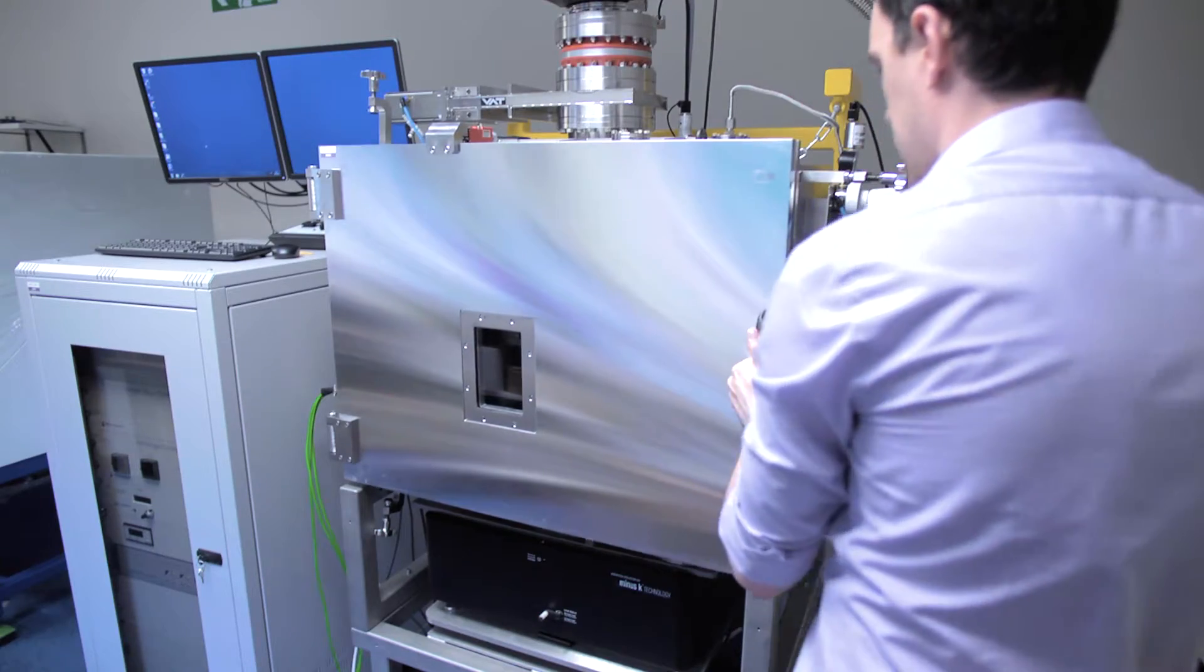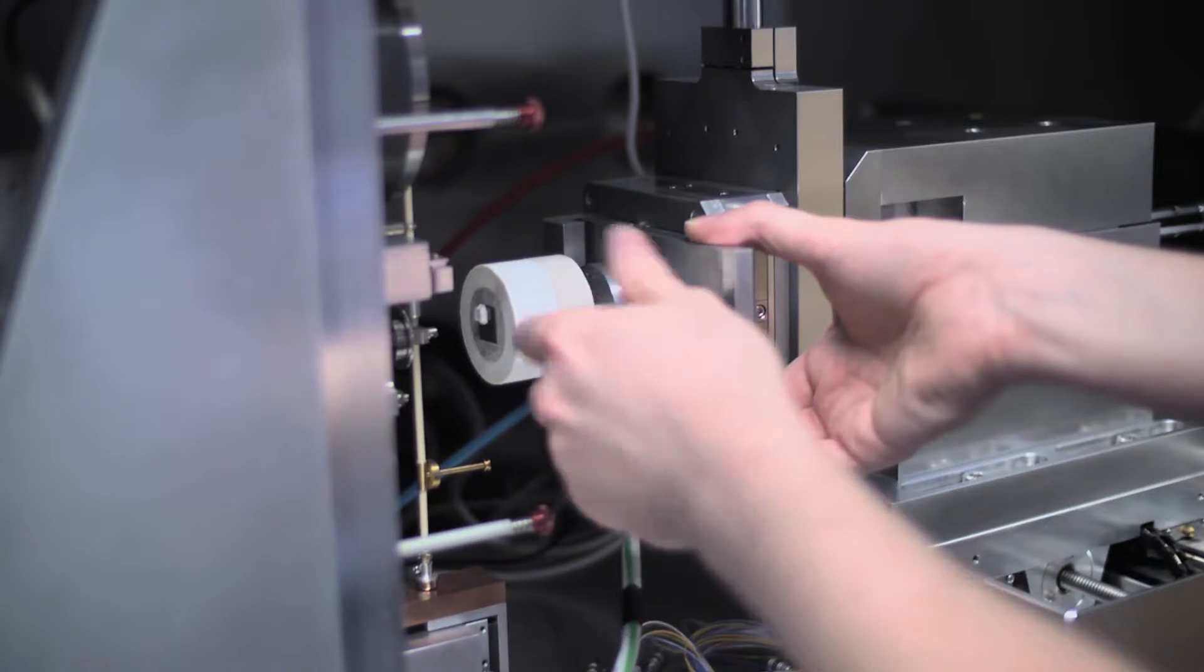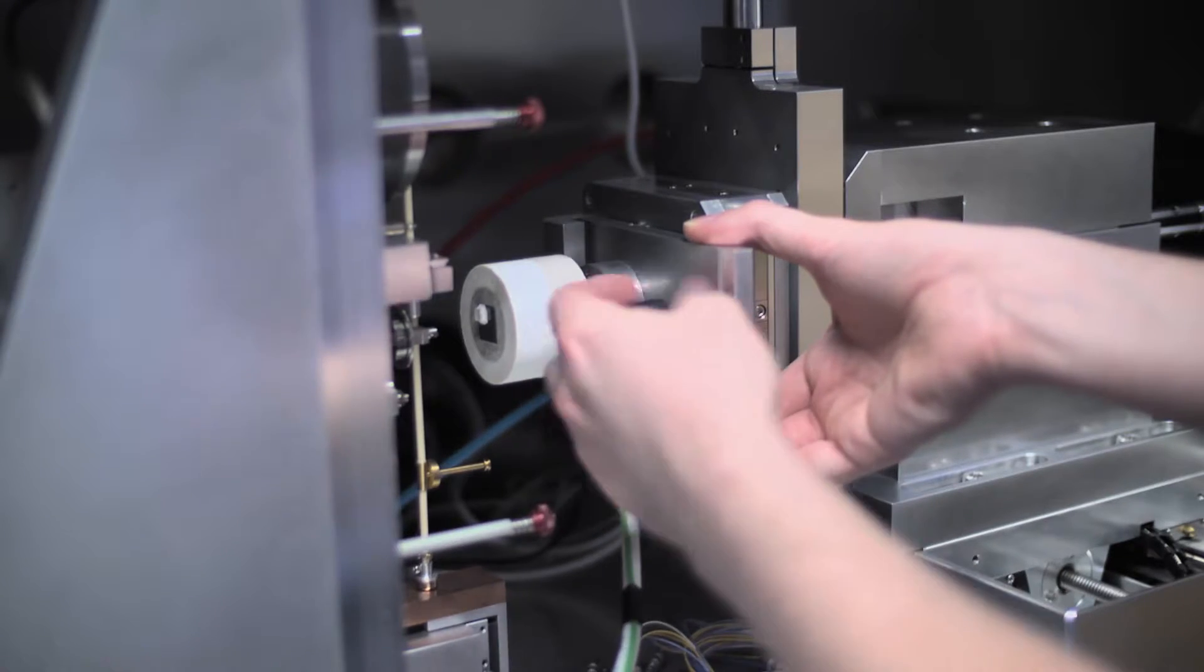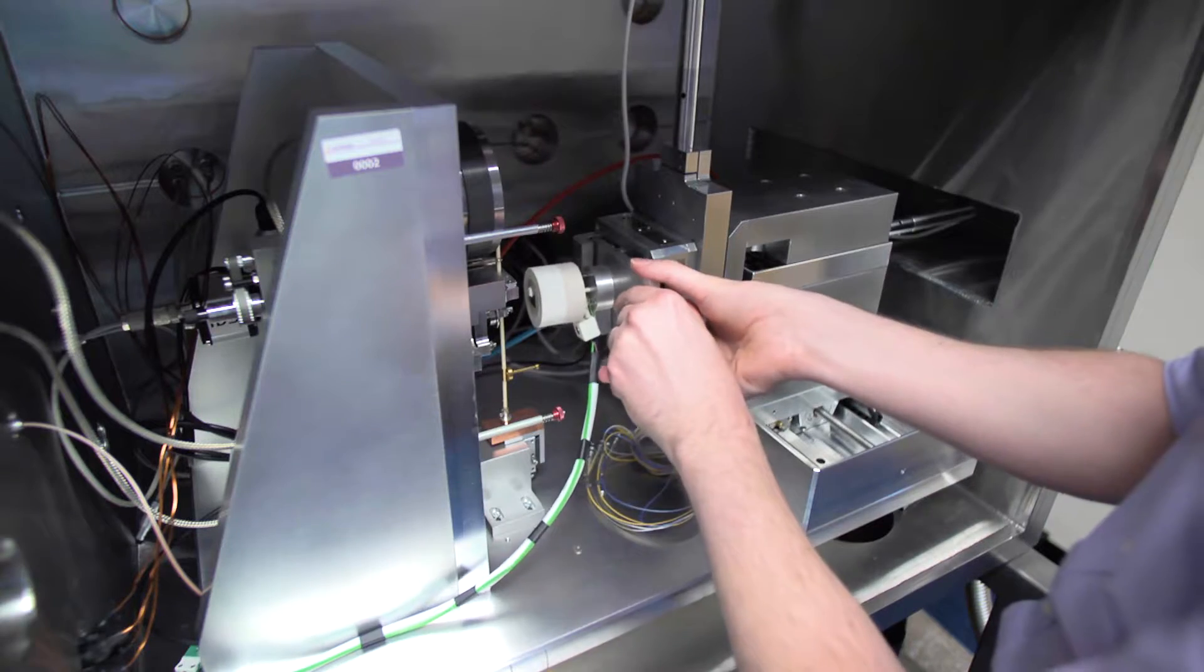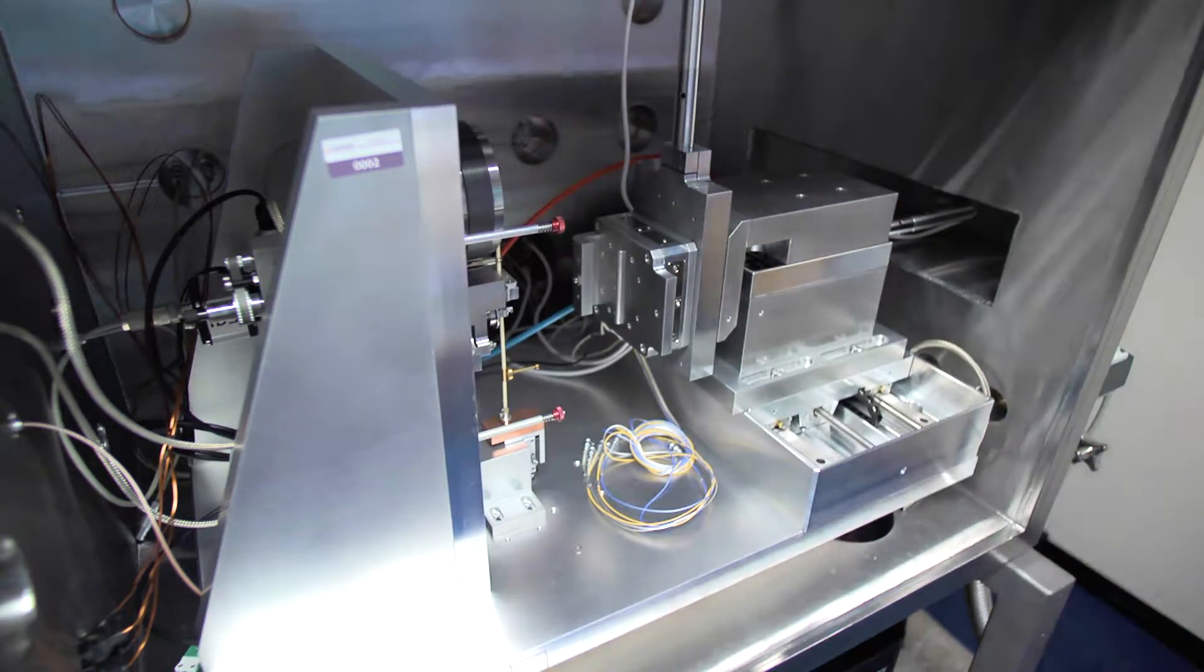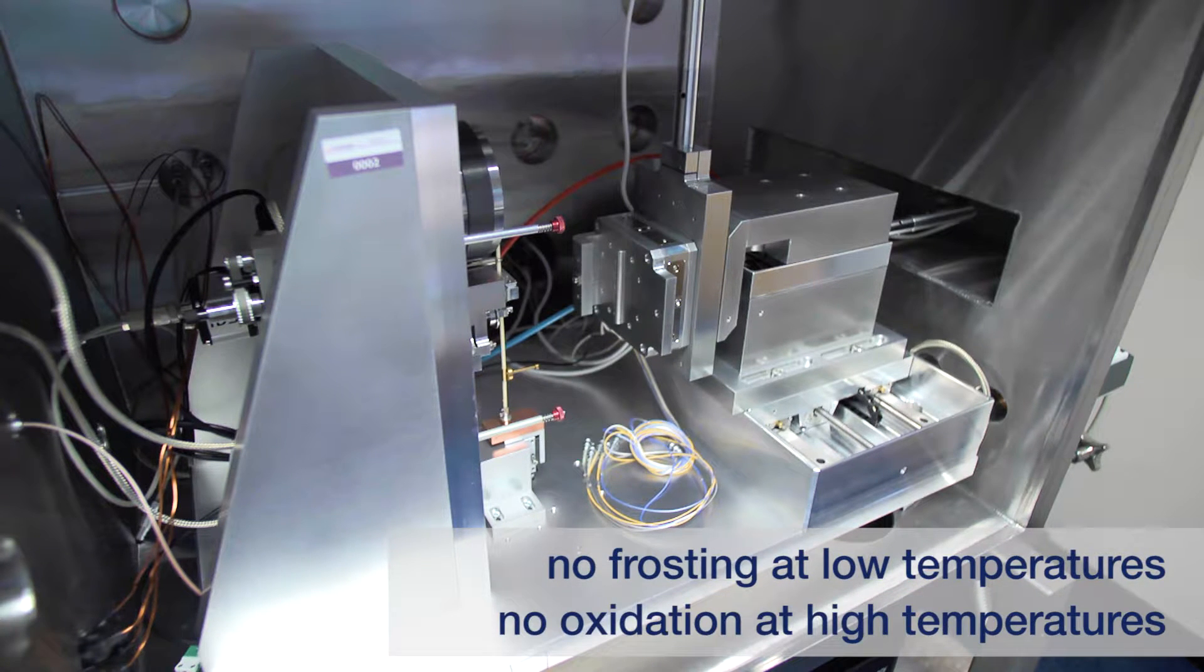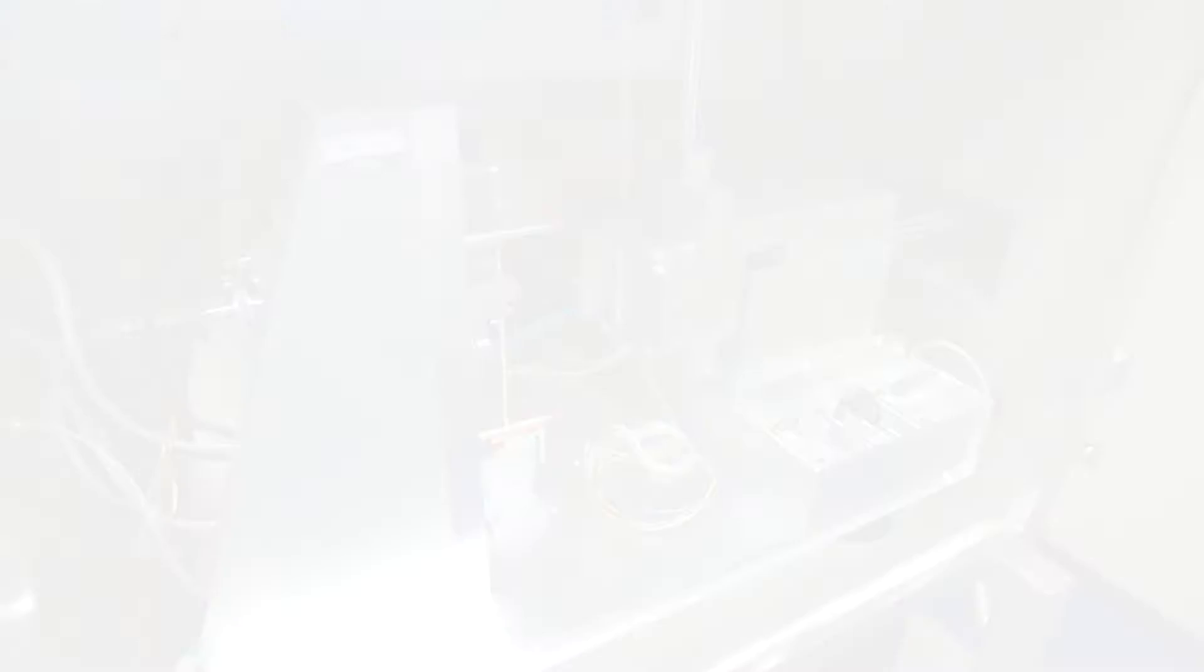Micromaterials has considerable experience in providing instruments capable of high and low temperature testing. Until recently, the limitations of these have been oxidation at high temperatures and frosting at sub-zero temperatures. Testing under vacuum removes these limitations and allows further expansion of the temperature capabilities of the nanotest range.